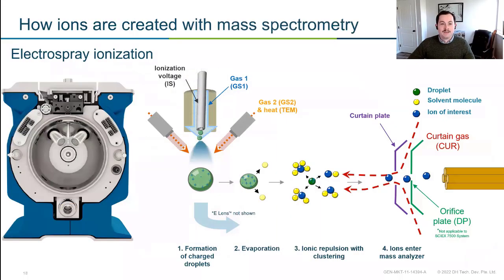So how does it work? On the left, we have an ion source, and on the right, a little schematic of how that ion source is working. In the image and the diagram, you see this capillary, or tube, surrounded by two heaters. Our LC is pumping the solvent, our analytes of interest, and analytes of uninterest, all through this capillary, and that capillary is essentially making a spray. One of the really important things in LC-MS analysis is that we have a good spray.